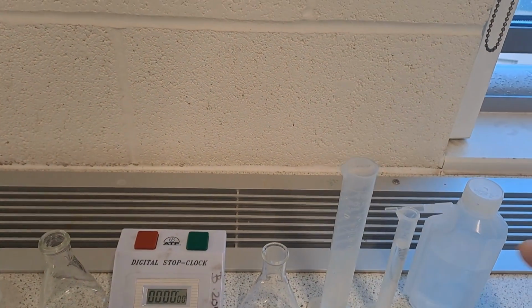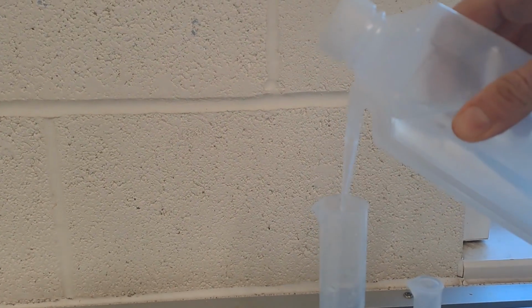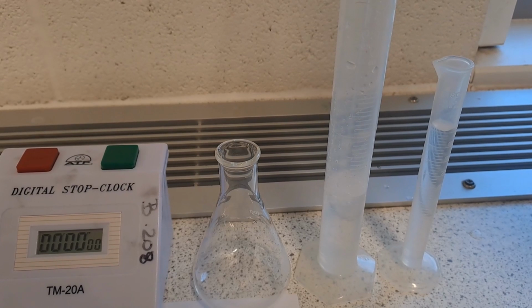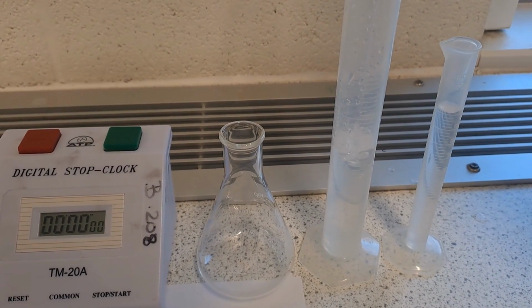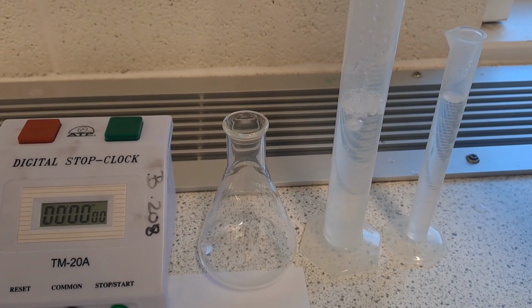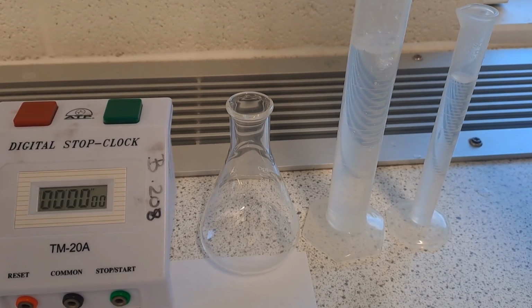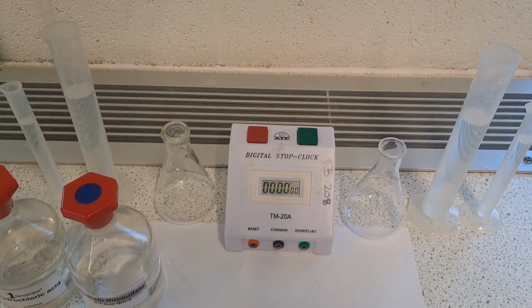Now I need the volume to be the same for the two of those, so I'm now going to top up this second measuring cylinder with water so that the total volume is also 50 centimetres cubed. Because the total volume of the solutions is going to be one of my control variables, and therefore I need it to be the same for every experiment. So I'm making my lower concentrations of sodium thiosulfate by diluting my higher concentration, and I'm doing this using a measuring cylinder so that I can see exactly how much water I've added and therefore calculate a new concentration.